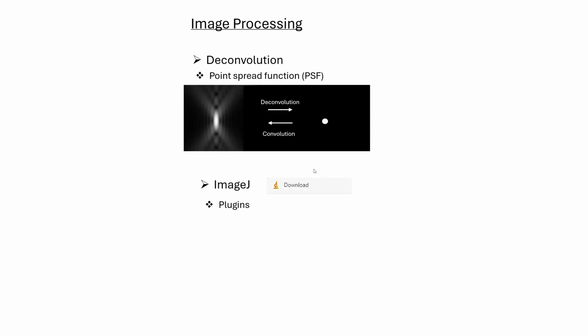To help achieve an efficient segmentation of rolling circle products in the MolBoolean image analysis pipeline, we first need to perform a post-image processing called deconvolution. When an object is imaged with a microscope, it will appear slightly blurred with a certain noise around the edges of the object. This is called convolution of point objects. And the amount of blurriness is determined by a point spread function that's called PSF. Image deconvolution removes the noise around the objects in a microscope image and thereby improves their resolution.